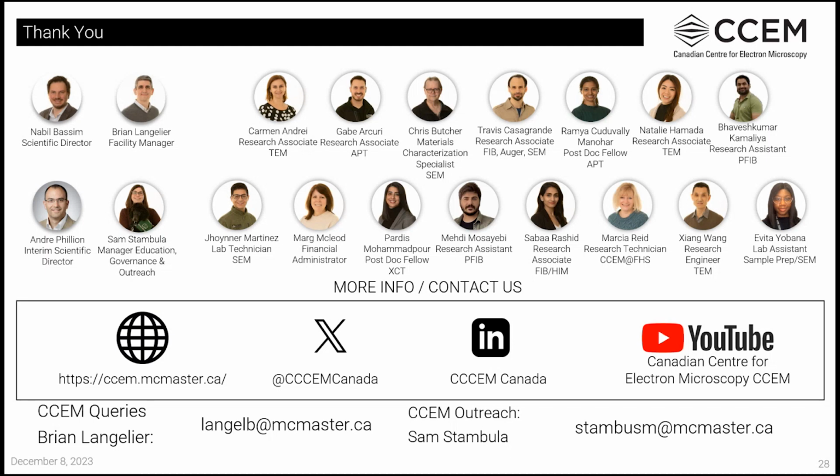So you can do all of that, of course, with this microscope. You can definitely put soft materials in this microscope, no problem. Oh, it's for EDS. Okay, no problem. You can do that. I would probably just do it at 200 kV just to confirm that it's carbon. No problem.